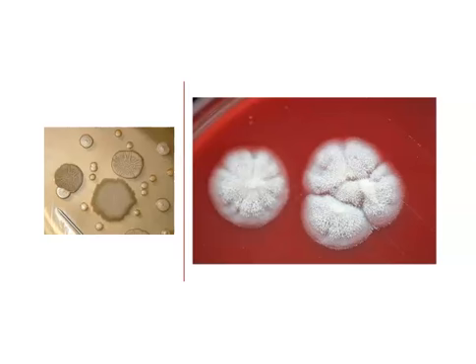We always hedge that by saying at a minimum, there are 3 or 4 organisms growing here. We always recognize that multiple species can have identical colony morphology.